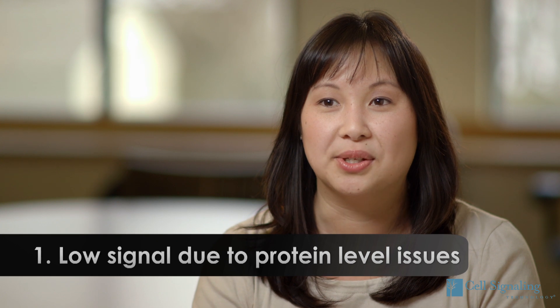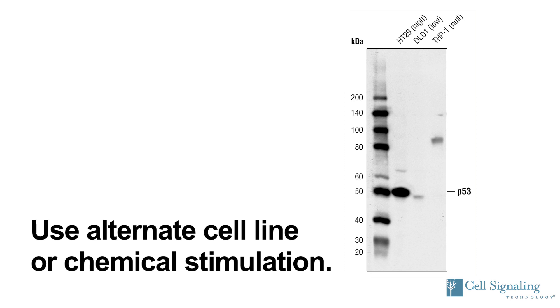There are a number of causes for low signal. The first cause is that the protein of interest is below detectable levels. If this is due to minimal expression in the starting cell line or tissue sample, a side-by-side comparison using an alternate cell line may be necessary, or a chemical stimulation to induce expression may be needed.